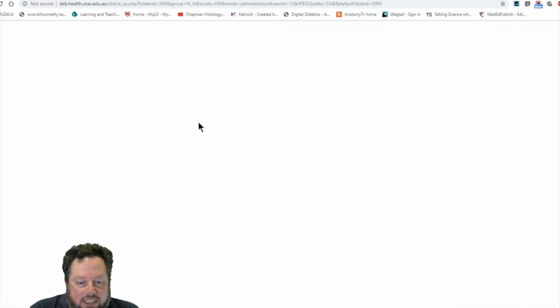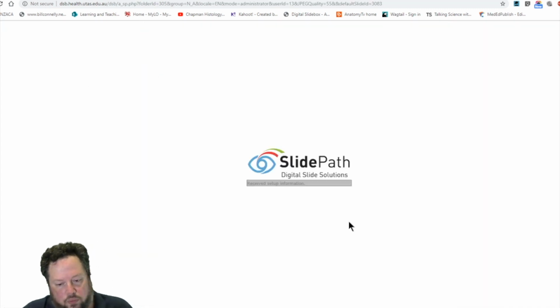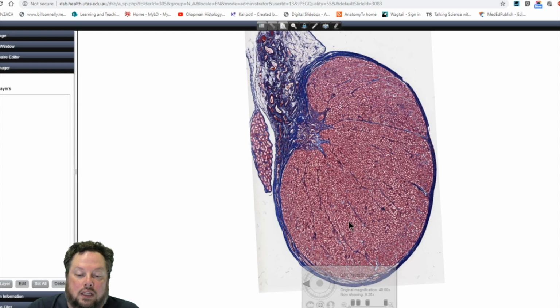It's a thickening of the connective tissue. I don't know if we consider it a thickening of the tunica. Well, it certainly looks like a thickening of the tunica albuginea. We sort of get a meet up here from the outside to the inside of these stroma, or septa, I should say. But it's certainly an area of thickening of connective tissue. So, I think that's probably a fair thing to say, Ruby, that it is a thickening of the tunica albuginea.